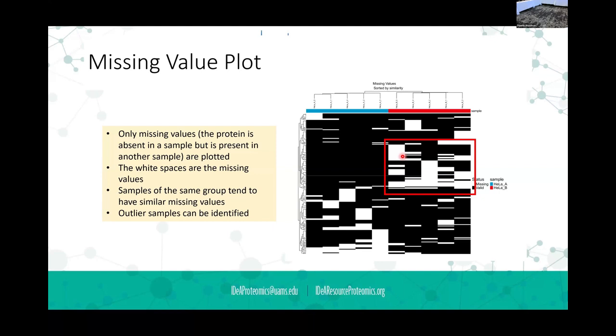It excludes all those. But that presence absence is something we spend a lot of time trying to coax people into, because they're like, well, just put a value in there. I just want a number so that I can get a fold change. I'm like, you've got better than a fold change. You can say, we have a sample here where we verifiably measured it, and now we have a sample where it's not there anymore. I mean, what's better than that?